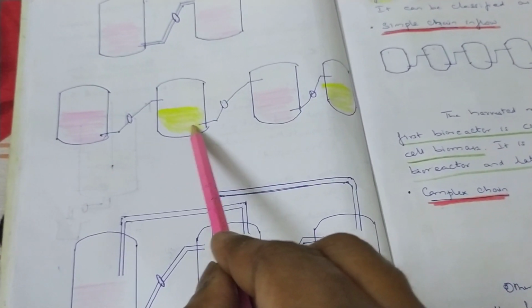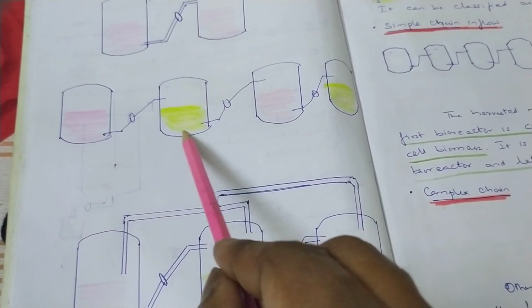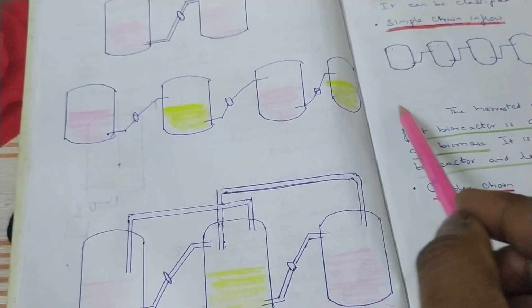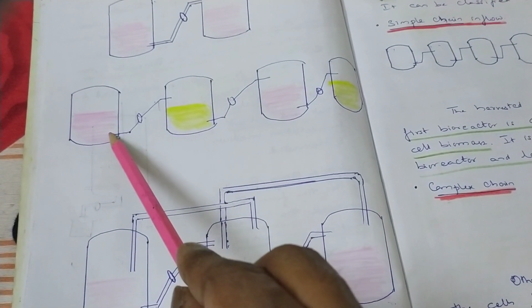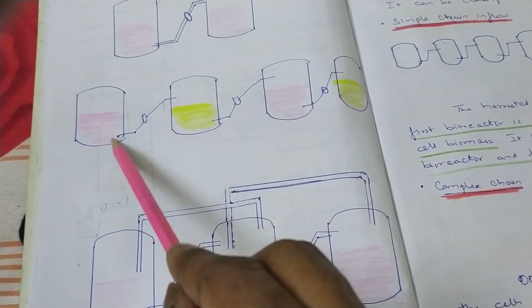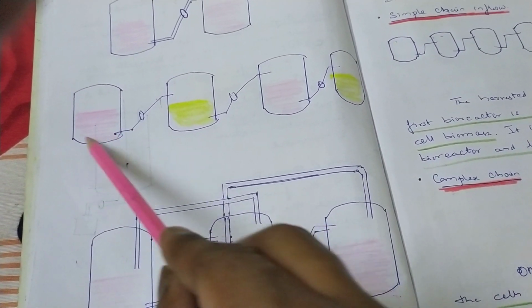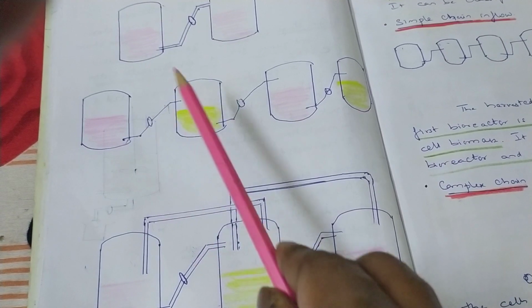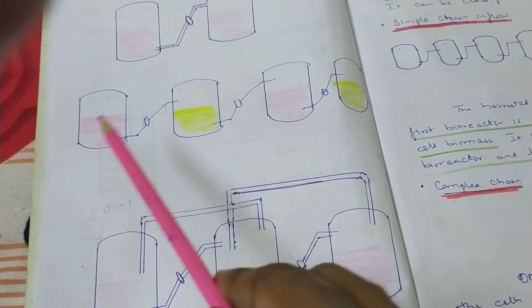And after 2 days, you're going to push these cells to this. So this will be ready. Okay, so these all are in a very acceleratory form, very fast producers. So this tank, whatever is there, you can harvest it completely after some stage, maybe the 4th day or 6th day, complete harvesting. This tank is empty now. Okay, you can understand like that. So what have you done by this mechanism? You have saved the time.